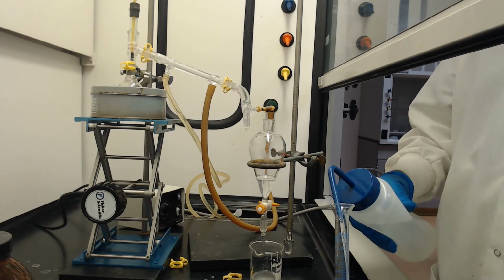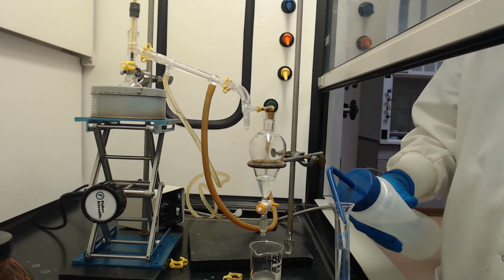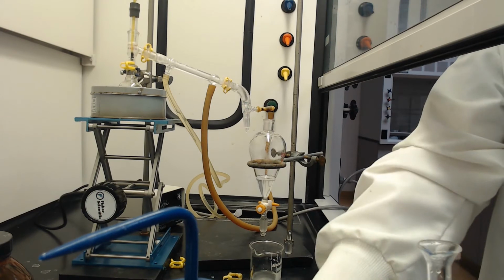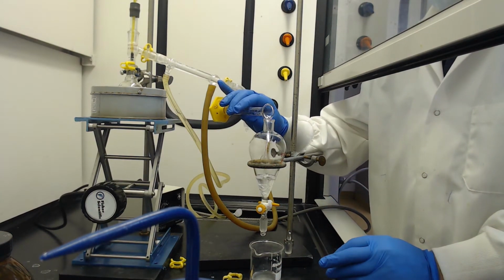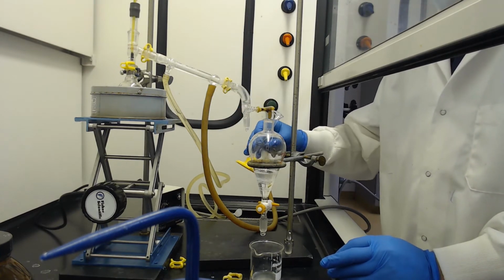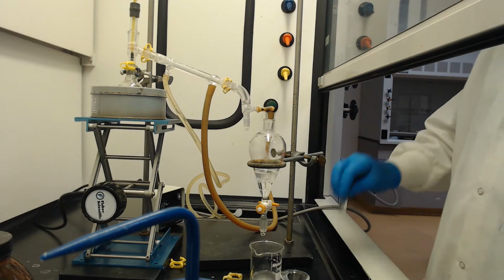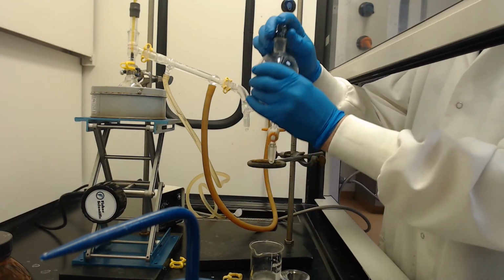This is going to wash out the bicarb. Sometimes you do these with saturated salt solutions. We're just using pure DI water. Our final wash, going into here. Now we shouldn't have too much gas generation, but you never know. So I'm going to get this out.